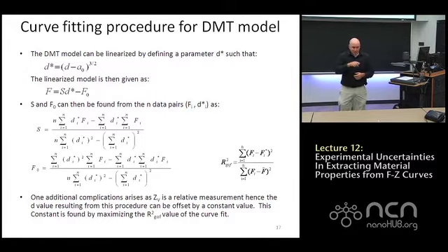You can look at the curve and try to pick a point, but that's slightly arbitrary. I would suggest using a method that a couple of guys suggested, probably 2000, 2001 or so, of using the R squared value, which is just the goodness of fit parameter. If you choose your model fit such that the R squared value is best, let that determine where your 0 location for D is. Probably not a perfect way of doing it, but better than pointing and clicking and guessing where the 0 D is. Let the 0 location be a part of the fitting.